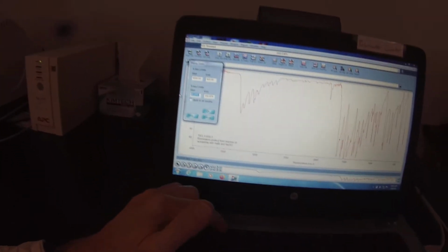I'm going to want to change my display limits. So instead of starting at 55, I'm going to start at 50. It'll give me an extra 5% for the peak labels. And now I'm going to go to find peaks. And I want these peaks here. Right, that's going to give me a lot of peaks over there, but I definitely want all these.